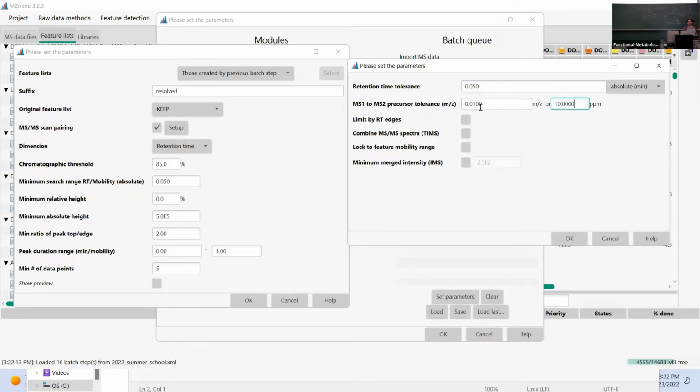And we also use a relatively wide MZ window. But if you consider that your quadrupole that is selecting the ions also has a pretty wide window, you're definitely going to have signals in there in the MS2 spectrum if something with like 10 ppm was detected at the same time, or like 0.01. The quadrupole usually has unit resolution, a bit better if you have a good quadrupole in your instrument.